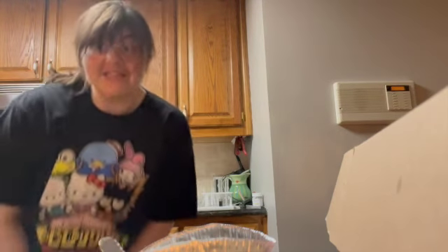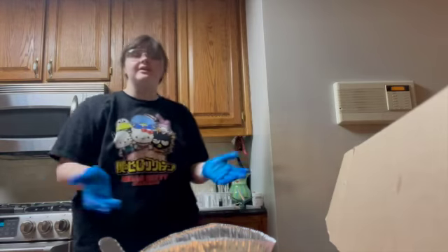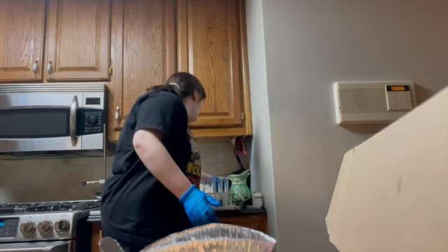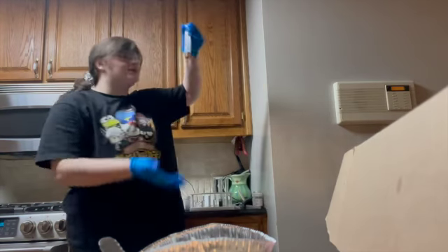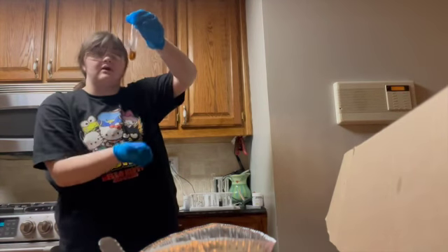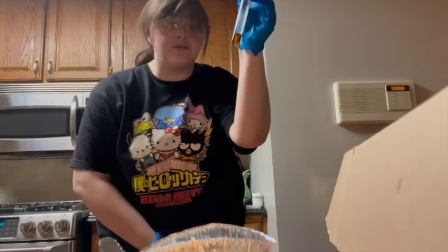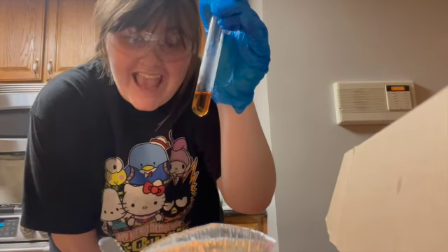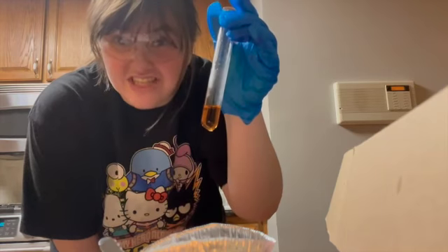So for reaction 3A, we have hit the 3-hour mark, just a few minutes over that. And it is still this orange color. I do not know how long I need to wait for it to fully clear, but right now we're at 3 hours and it's really not changed that much at all.